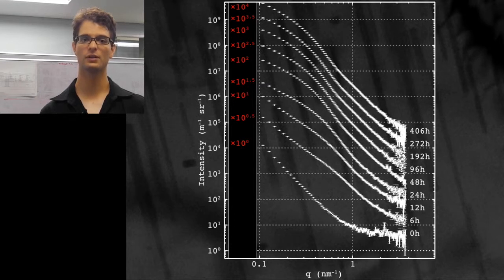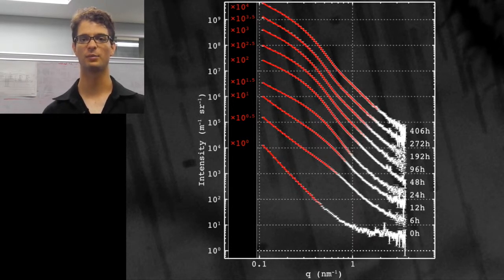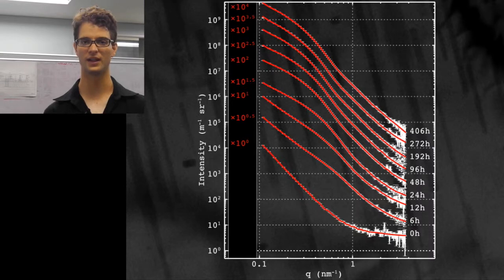Armed with this information, we can now fit the small angle scattering patterns all to within the uncertainty of the data.